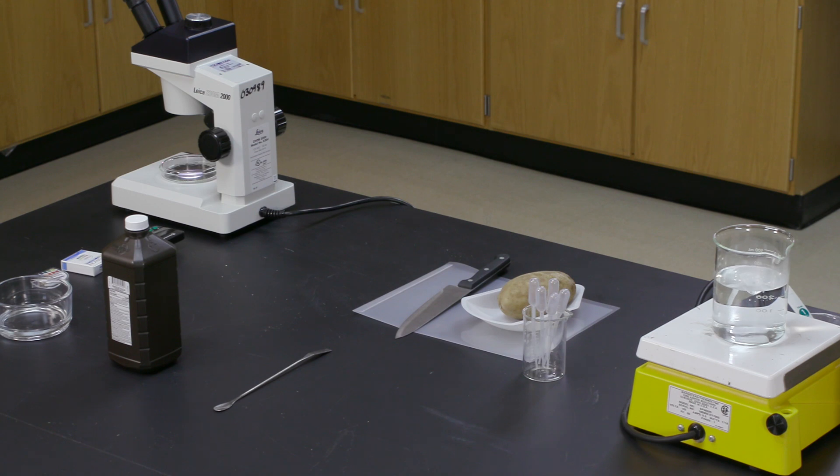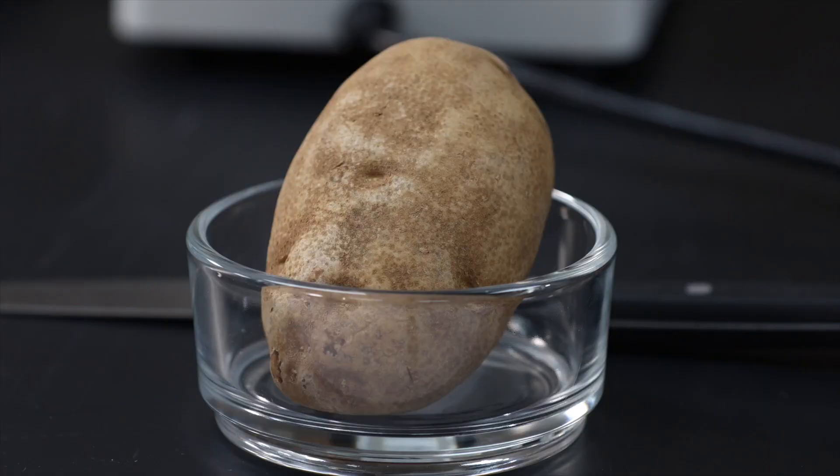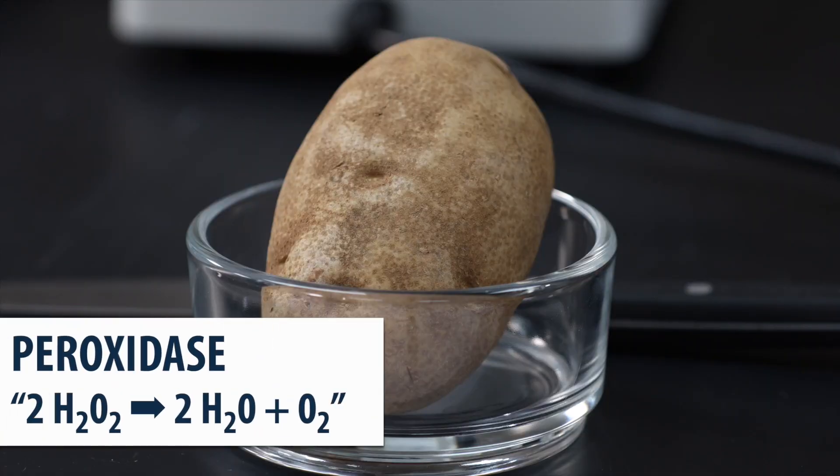In our third and final test, let's examine how heat can destroy the activity of an enzyme in potatoes. The enzyme is a protein. Potatoes have an enzyme called peroxidase, which splits hydrogen peroxide into water and oxygen.